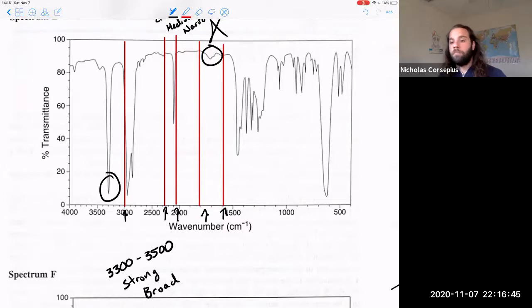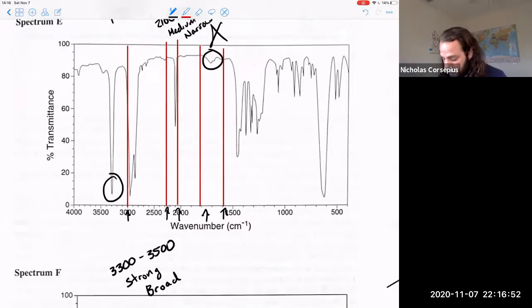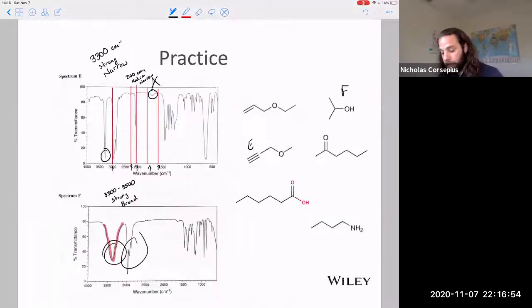Second of all, beyond matching numbers, what's easier to see are these patterns, right? So being able to identify that this is an alcohol group, being able to identify that ugly broad peak as a carboxylic acid group, that medium two-hump peak as a primary amine, et cetera, okay? So I'm not saying you can't use the table in the book. I'm saying that you don't want to get married to it to the point where that's the only way that you can do these analyses, okay?